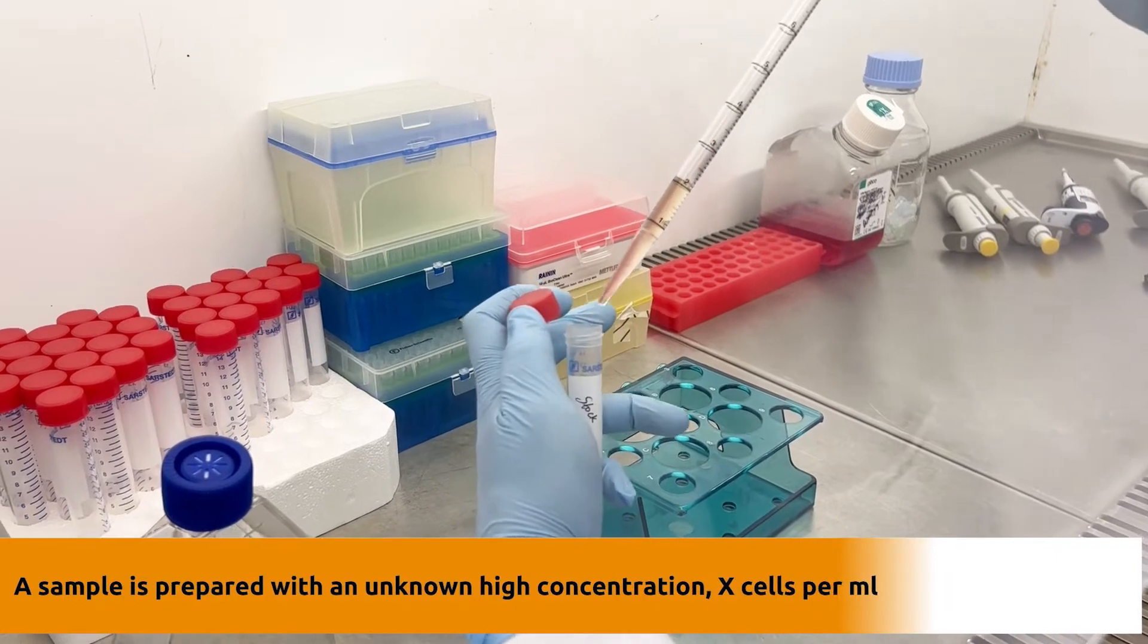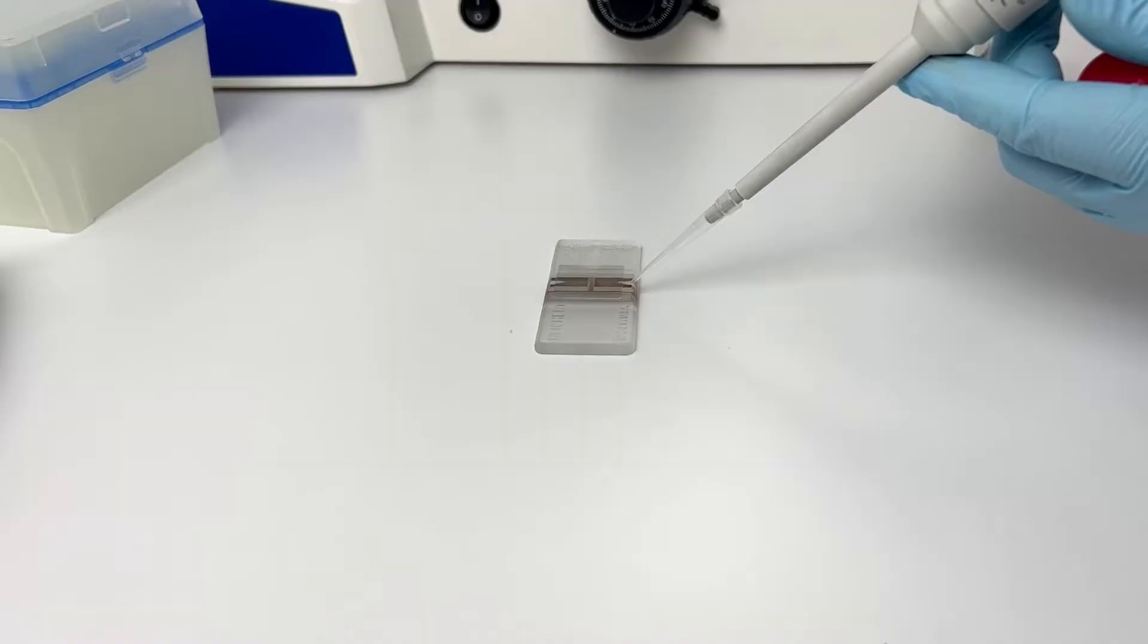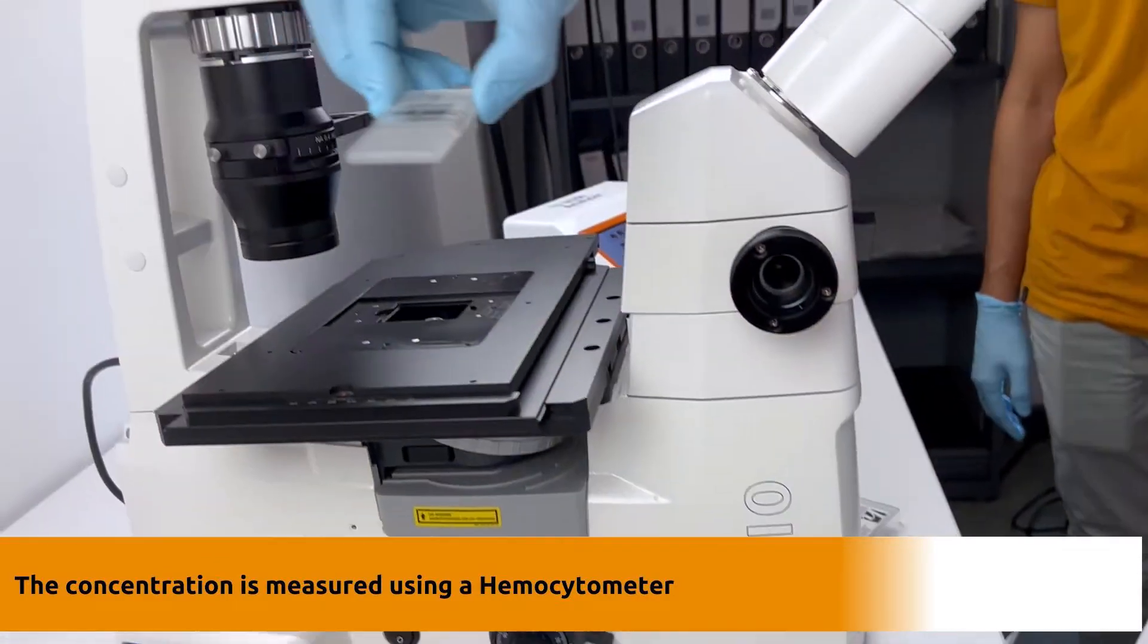For the experiment, first, a sample is prepared with an unknown concentration, x cells per milliliter. The concentration is measured using a hemocytometer.